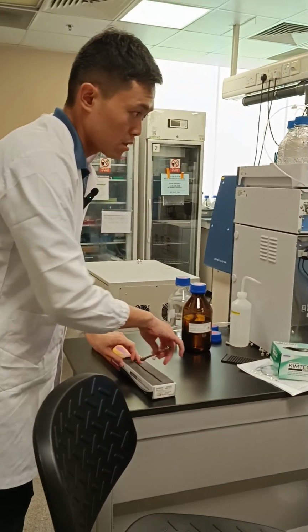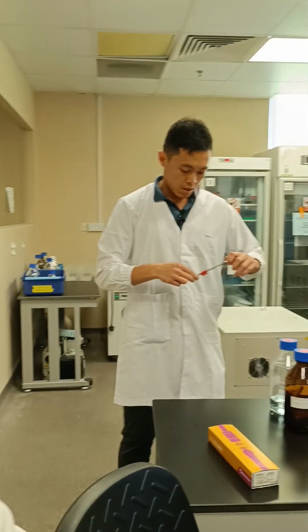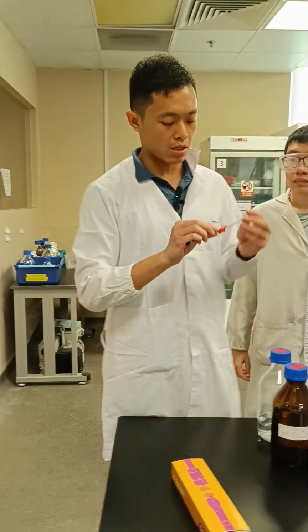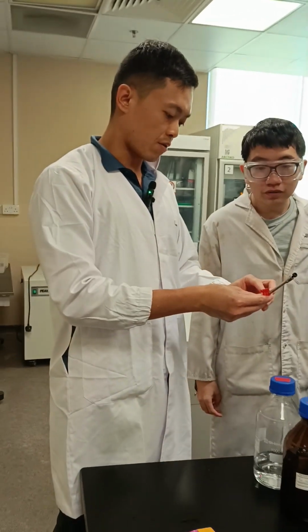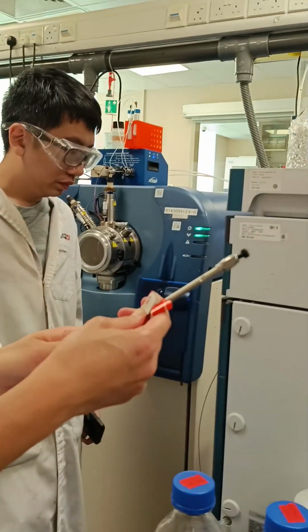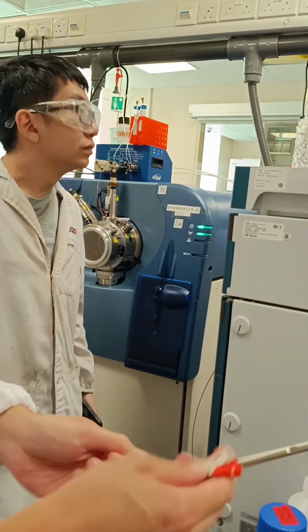Before you flush the column, of course you need to install a column. If you look at this column, you'll notice there's a label here showing the direction of the flow. So you need to follow this direction accordingly.